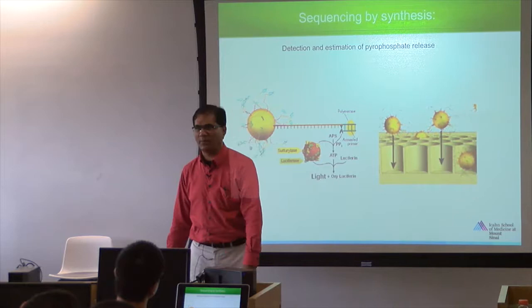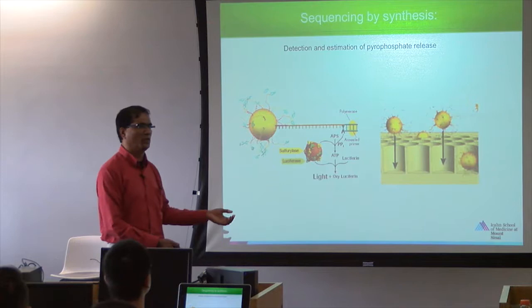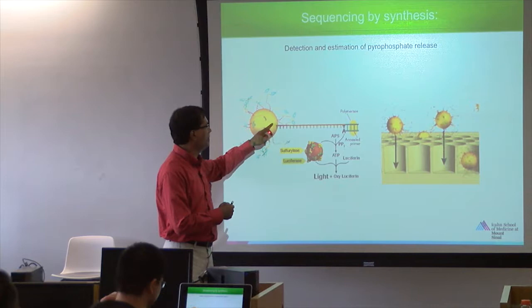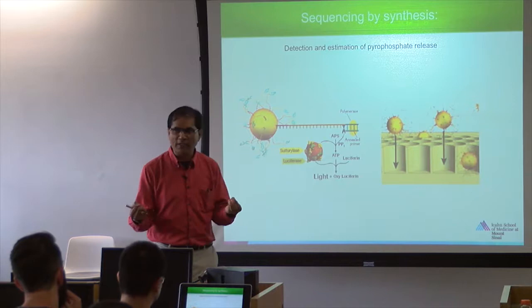So that is how, out of million-well plates, you increase your efficiency to put as many single beads in as many wells as possible. Out of those 100 million, initially, if you put one bead at a time in one well, you get only 500,000 reads. If you increase the efficiency or titration, one strand should go and sit with only one bead. There should not be two different strands. If they are on the one bead, it becomes a problem. Right? You reject that. You don't sequence that. That's all titration, basic high school mathematics, picomolar concentration.